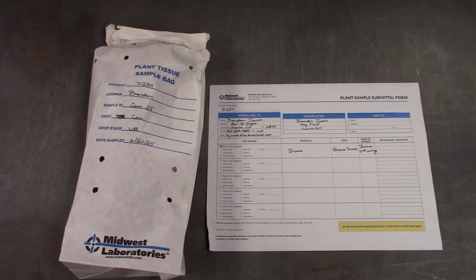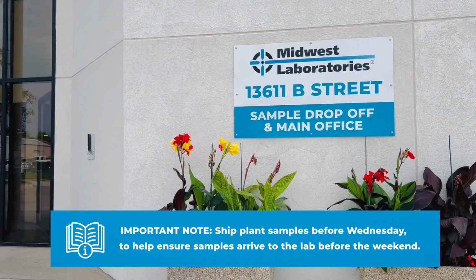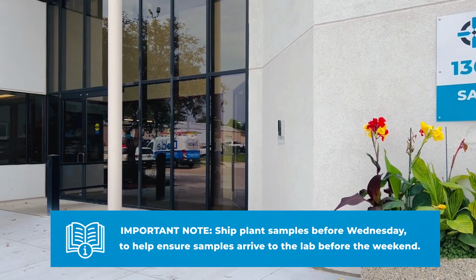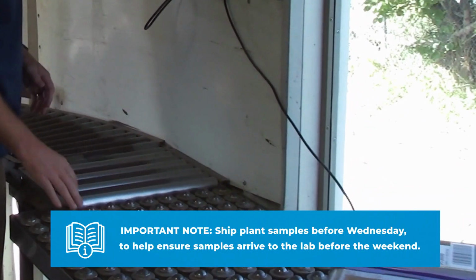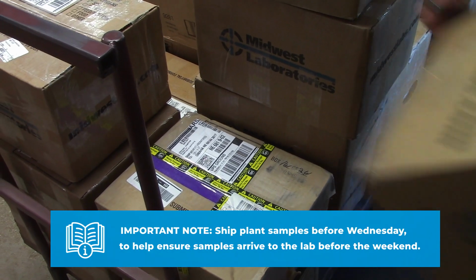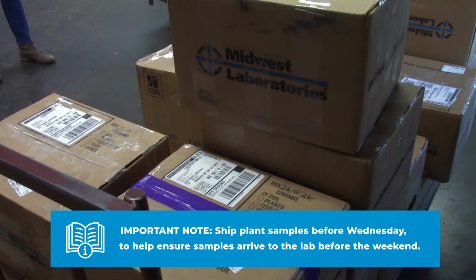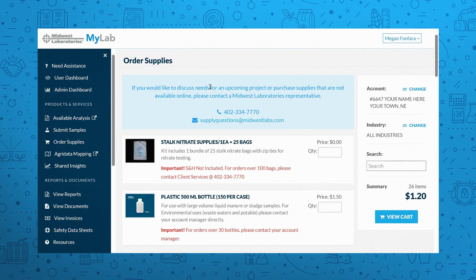And then make sure to ship before Wednesday each week so that it gets to Midwest Labs before the weekend, preventing it from sitting on a truck in warm weather and possibly molding. And you can just use a regular Midwest Labs box or just a box that you have to send to Midwest Labs. You can also use the MyLab portal to order supplies and print off your sample paperwork.